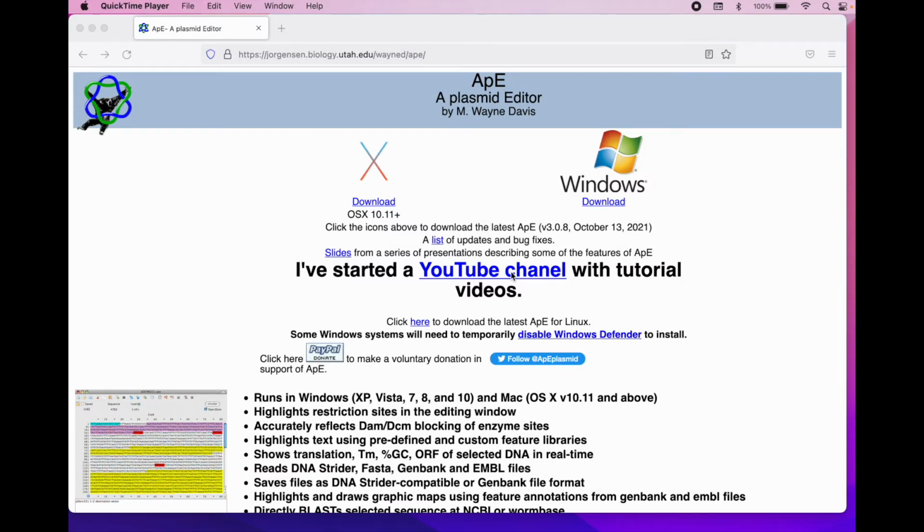We're going to look at some DNA sequences and some DNA design software called APE, which is short for a plasmid editor. We're also going to do a little in silico experiment, and if you haven't heard of the term in silico before, it is short for in silicon, which computers typically have silicon for the transistors, so in computer experiments. And hopefully that in silico experiment is going to reflect something similar to what you see in the real world later on when you're working in the lab.